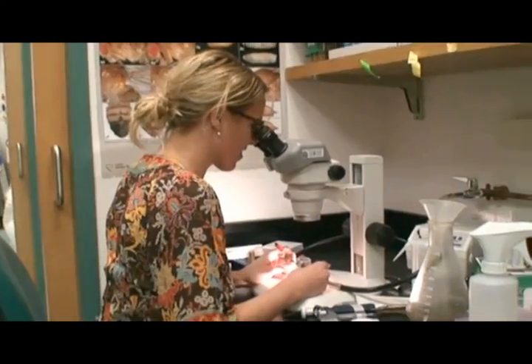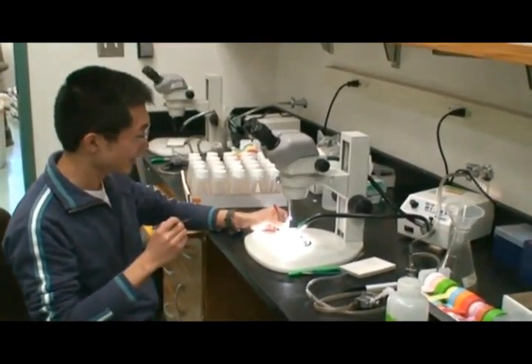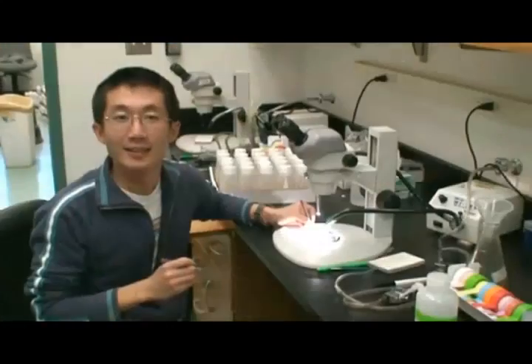Do you find fly brain dissection difficult? God, this is so hard. Prone for mistakes? I made a mistake again. And frustrating? Tell you what, there is a better way of doing it. Really? There is? Tell me about it.